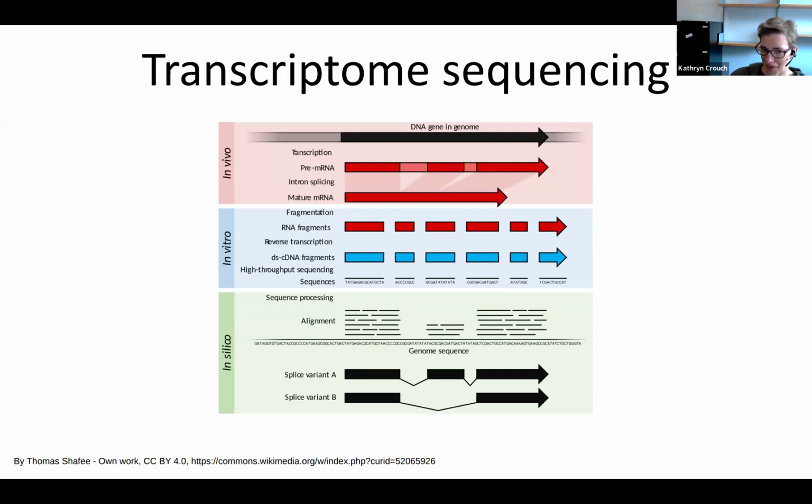And from this, you can basically look at two things. One of those things is, as we said, the genome structure. What you'll notice here is, because we align these to the reference genome, which has the introns in place, the coverage looks like you see here. It's going to have blocks where you have reads aligned. Those represent coding sequence, sequence that is transcribed. So those are going to correspond to the exons.